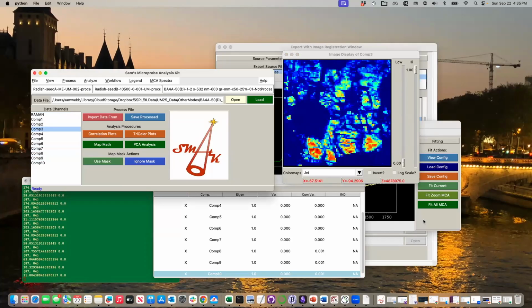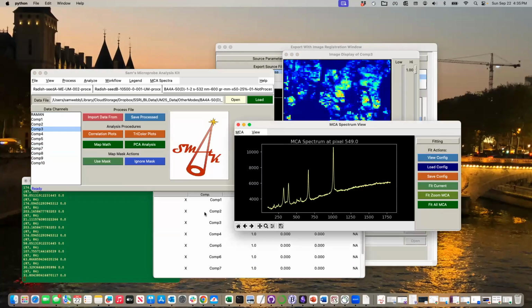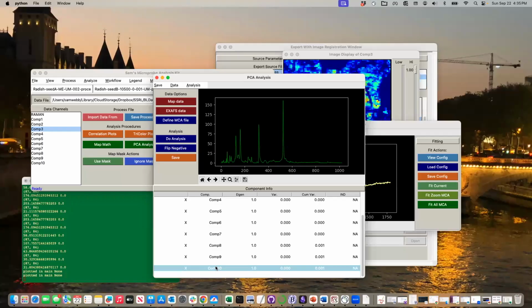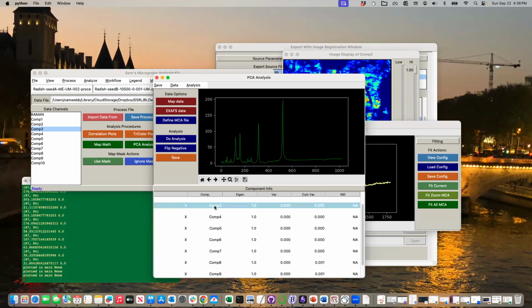So if we look at those, that's 3 and 10, for instance, right? If I look at what 3 and 10 look like, they're really similar. There's actually a little bit of a shift in here. What's going on here? Let's look at this peak around here again. So we have that one. Oops, of course it zooms out on me. And this one, this one's a little cleaner.